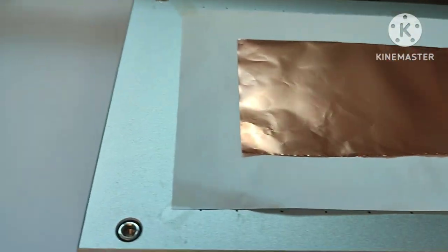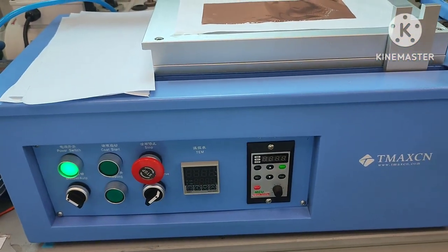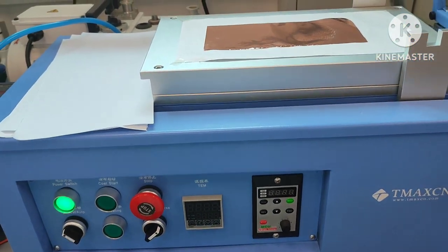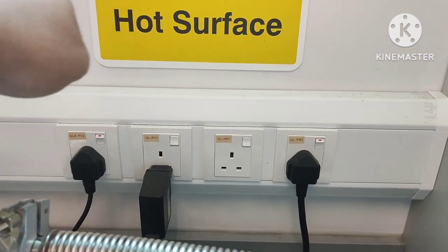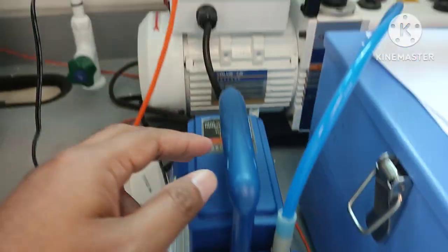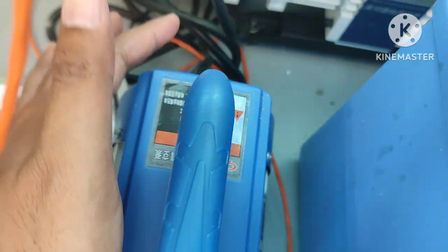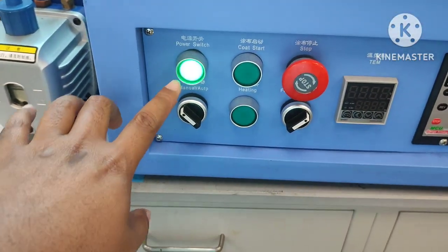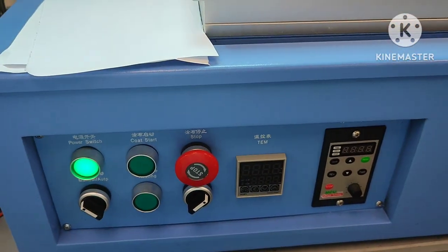First you need to open the machine. It's quite easy — I'm also new to this project. First of all, open the switch. We have 2 switches: left and also right. And we also need to open the pump. There's one switch here, and here you just open the pump. Then just click the power switch. Settle down for that.